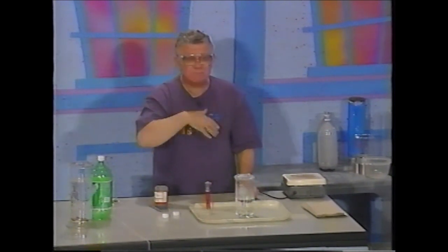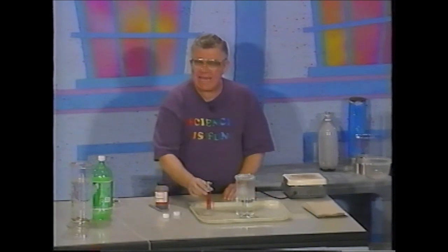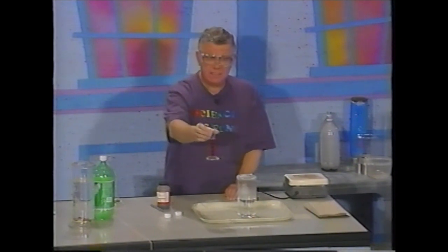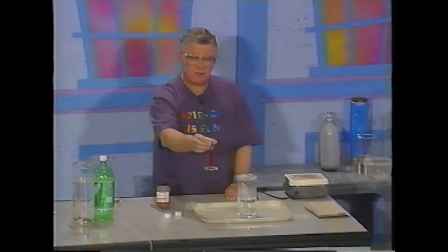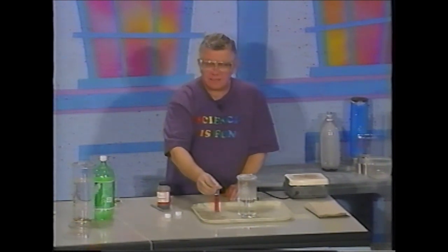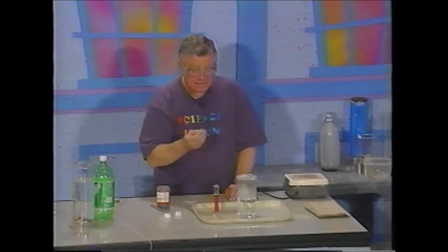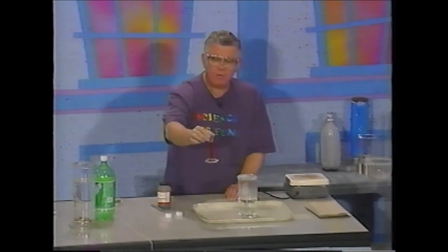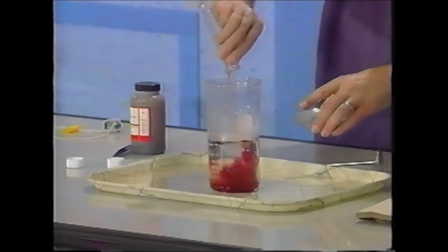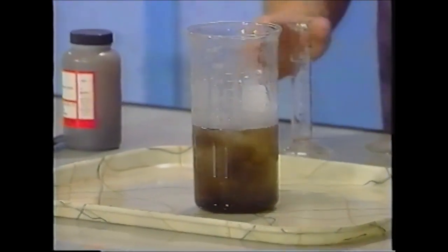So what we have to do to speed up the rate of a reaction is add a catalyst. I have a catalyst now in the form of a liquid. This liquid is a solution of a metal ion called cobalt. It's actually a solution of cobalt chloride. One of the characteristics of a catalyst is that it is not consumed in the chemical reaction. It is used, but then it's regenerated. So I want you to remember what the color of the catalyst is as I take this catalyst and add it to the mixture of hydrogen peroxide and potassium tartarate.